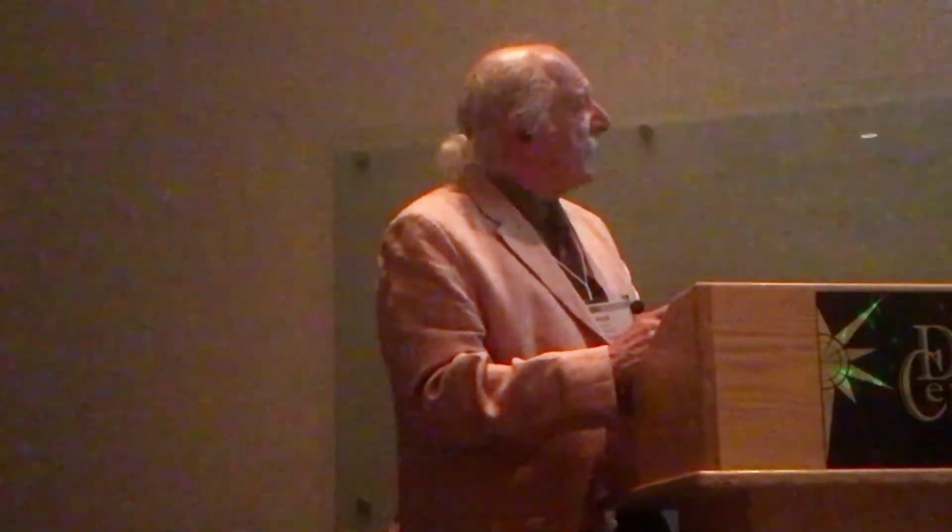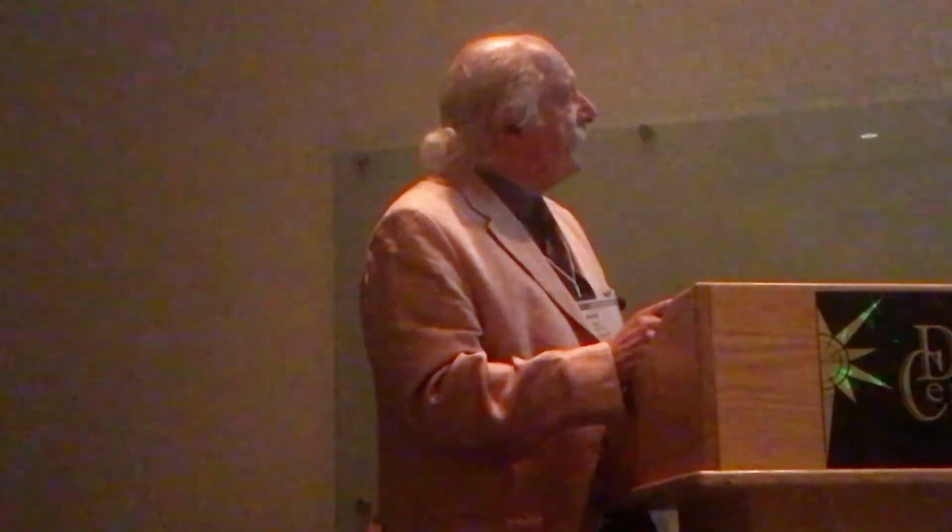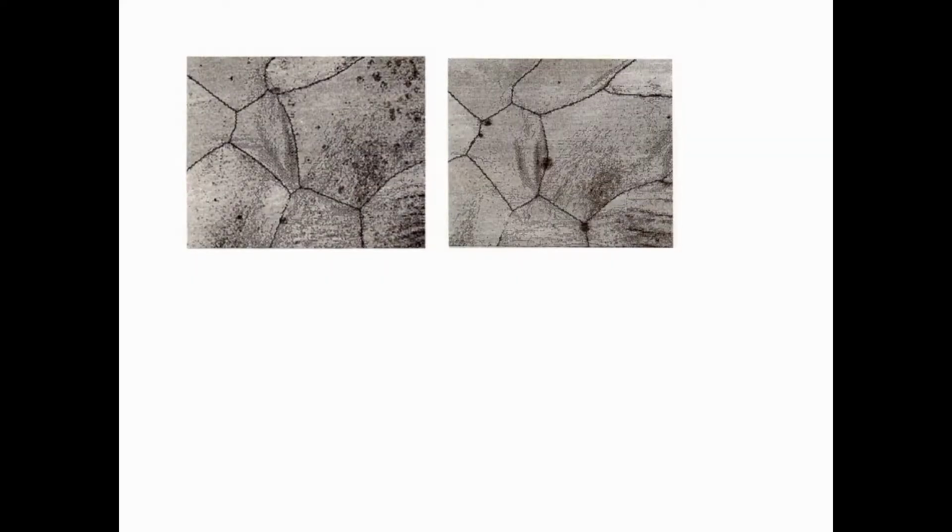But then a great contribution from the TSL team, led by Stuart Wright, where they said, let's use the orientation measurements we've got within a grain and average it to get some idea what the average misorientation is within a grain, or we could actually look at nearest neighbor misorientations, and it's called a kernel average.